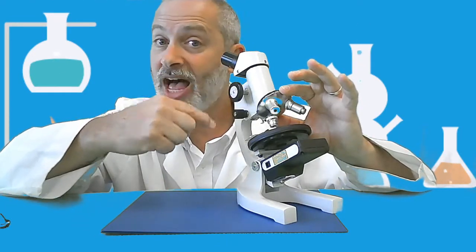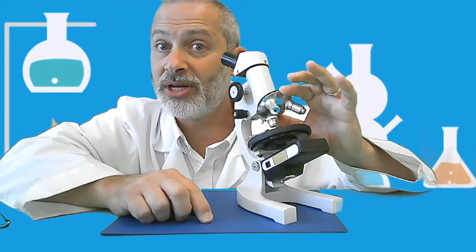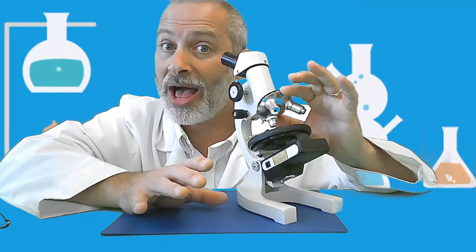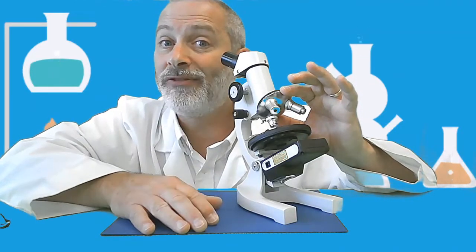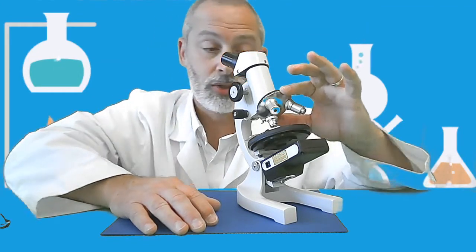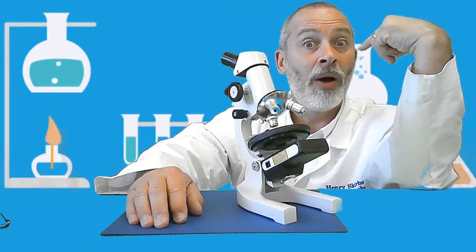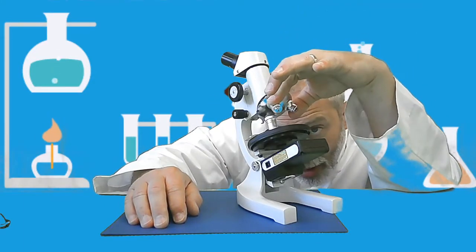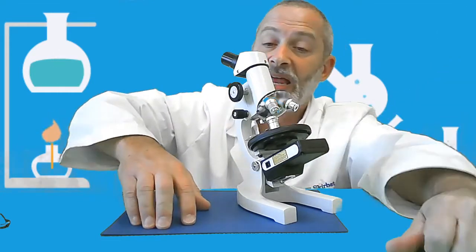But notice, I'm not turning the coarse adjustment knob anymore. Because once you have it in focus on low power, you should not have to move the coarse adjustment knob anymore. So it's in focus for me, even though I'm not wearing my glasses. I'm going to turn it over to the medium power. Plenty of room, plenty of room.